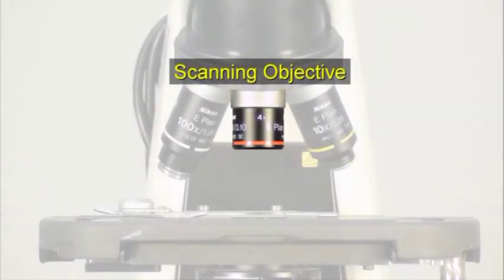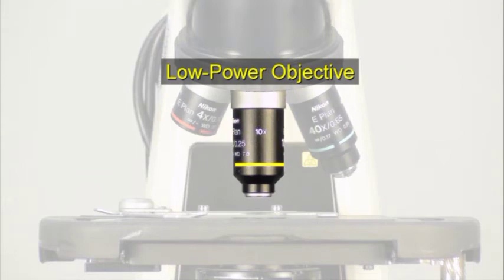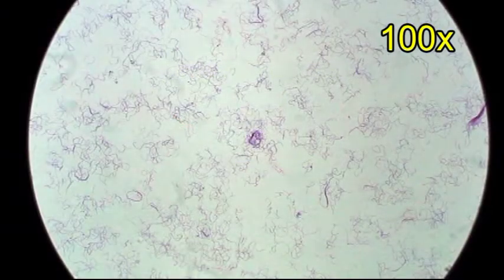Each successive objective is longer with increased magnification. Next is the low power objective with a 10x stamp and a yellow band. It yields a total magnification of 100 times.